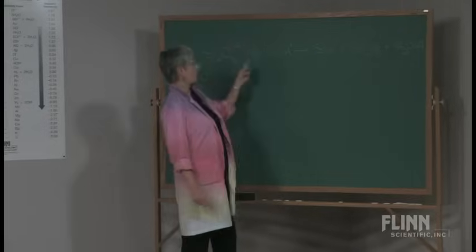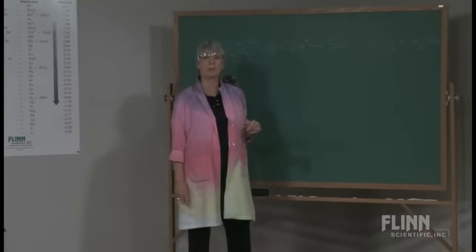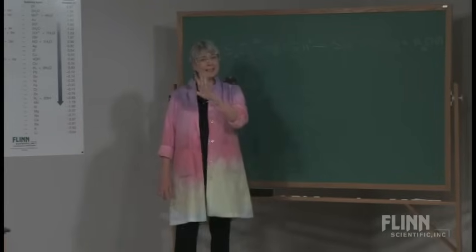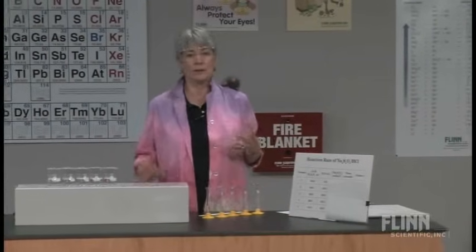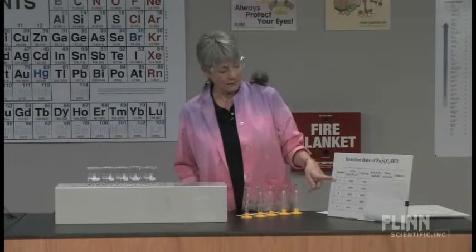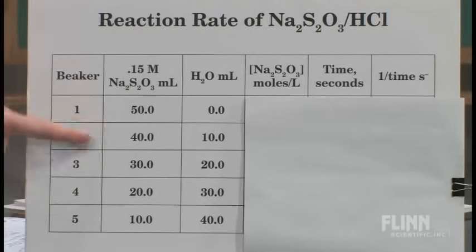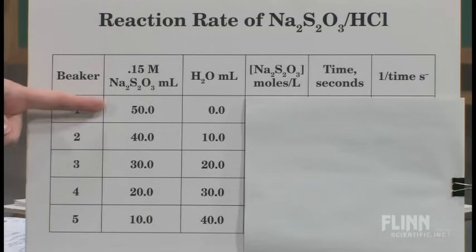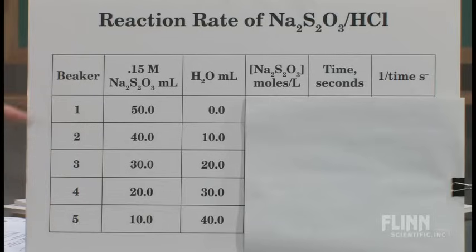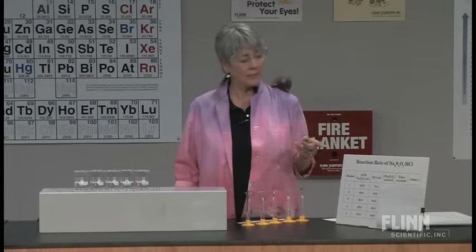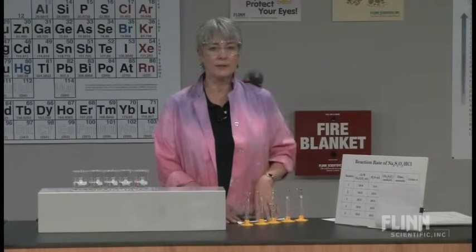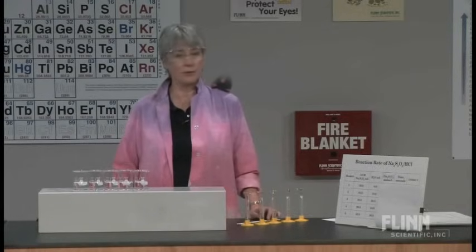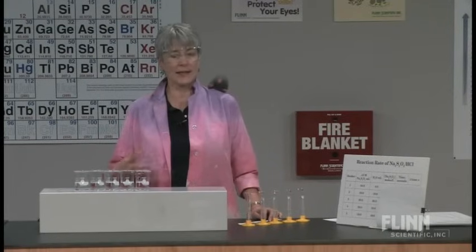You may have done this reaction as part of a chemical sunset, because there's a nice demonstration people do when putting it on the overhead projector, where you can see the colloid forming more and more. But we're going to do it as a lab and talk about concentration. I have five beakers with varying concentrations of the thiosulfate. In the first beaker, I've got the pure 0.15 molar sodium thiosulfate, and then I've diluted it along the way. I would give my students a data table and ask them to calculate those new concentrations for the other four beakers. We're going to add five milliliters of hydrochloric acid.